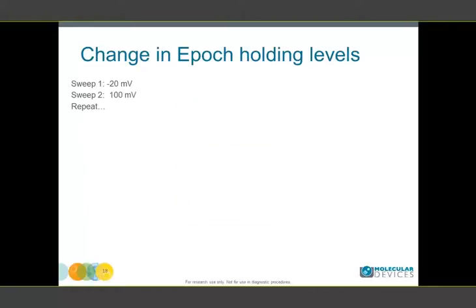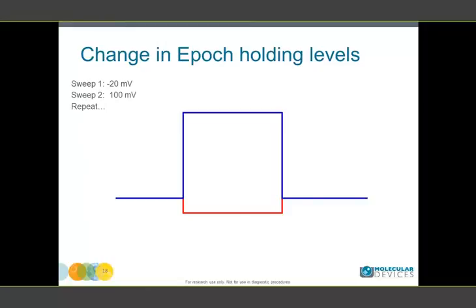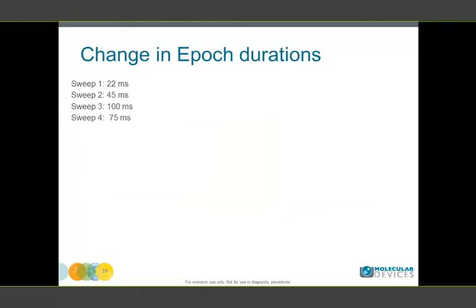Now you can also make these changes as a repeat. For example, sweep 1 minus 20 millivolt, sweep 2 100 millivolt, and let it repeat. How many times is up to you. And now I want to show you some examples.